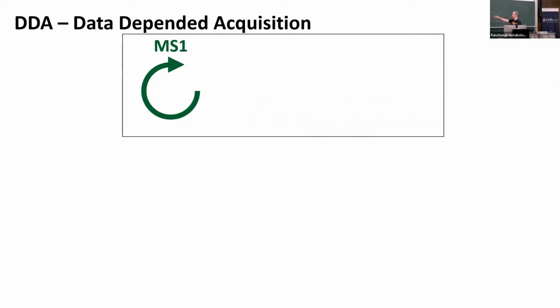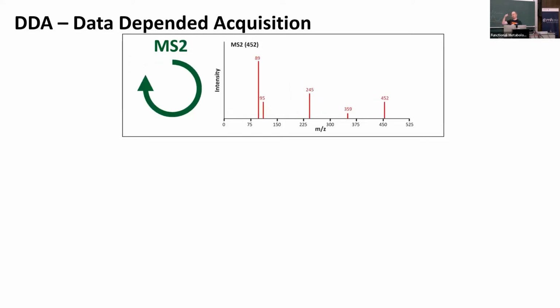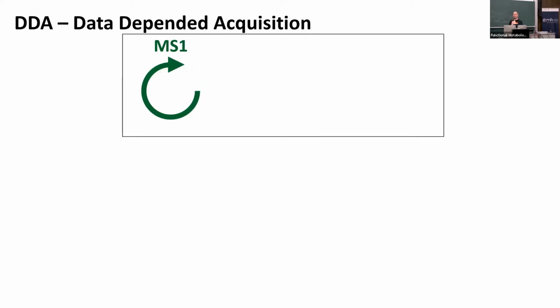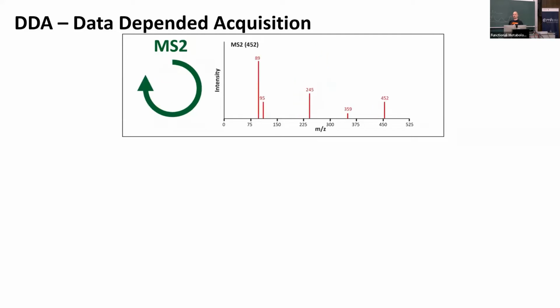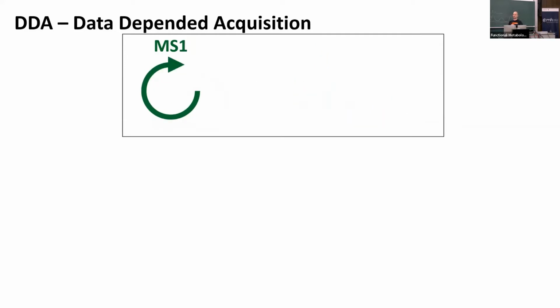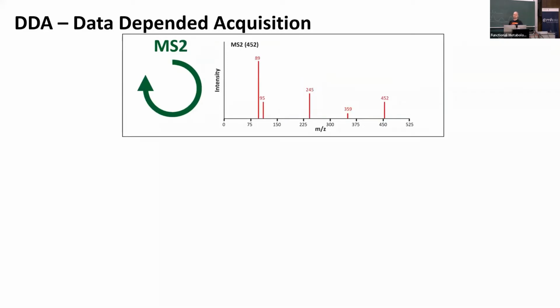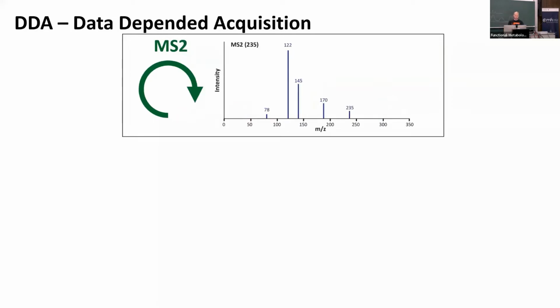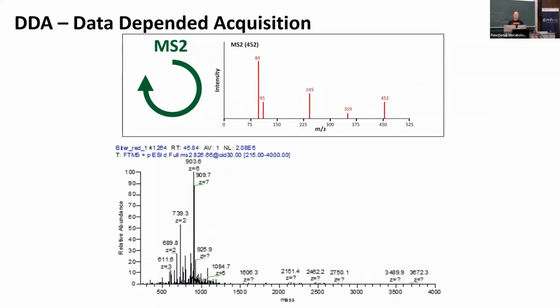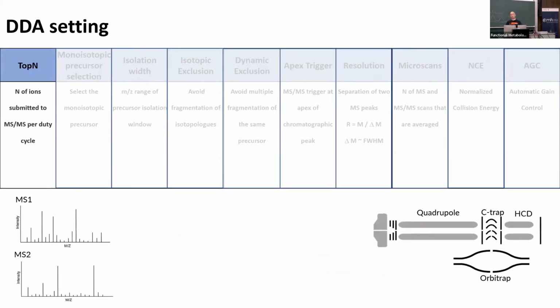And yeah, okay, we went a little bit into data points and chromatography and representation of peak shapes. But here, really the speed and the number of data points is important if you want to do any sort of MS1 feature finding and peak picking or deconvolution. We can talk about that in detail in a second again, if there are still questions. So yeah, we generate a lot of MS-MS, but how are we gonna set these settings up, right?